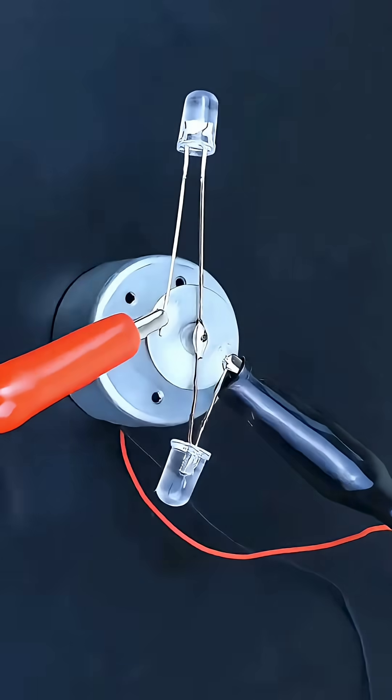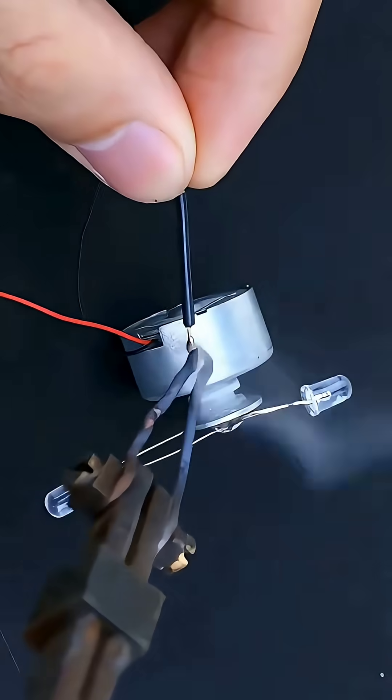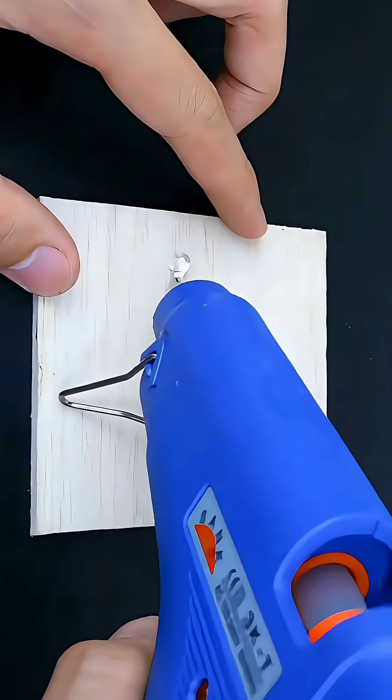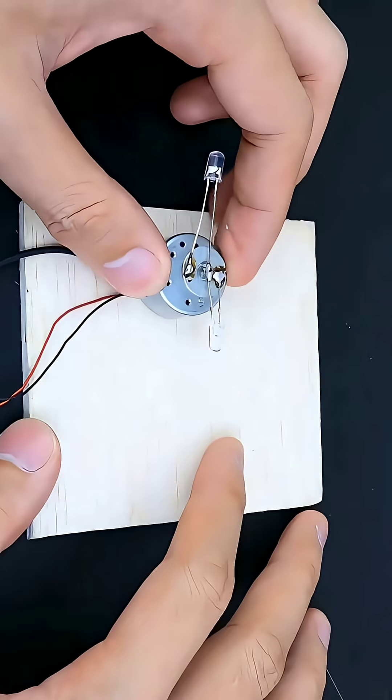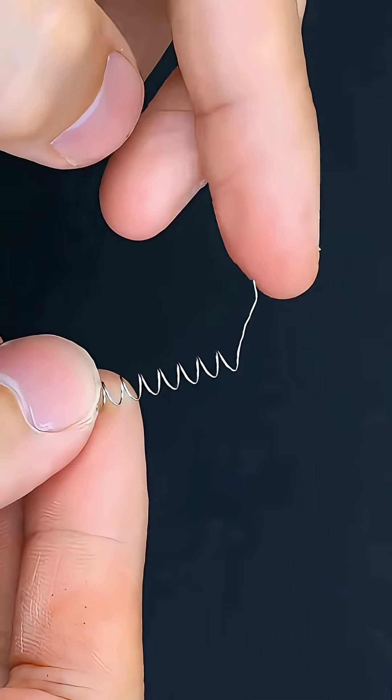As the chemicals mix, energy is released and you can instantly see a dramatic color change. This happens because of a rapid chemical reaction that releases heat and gas. It looks unbelievable, but this is real chemistry in action.